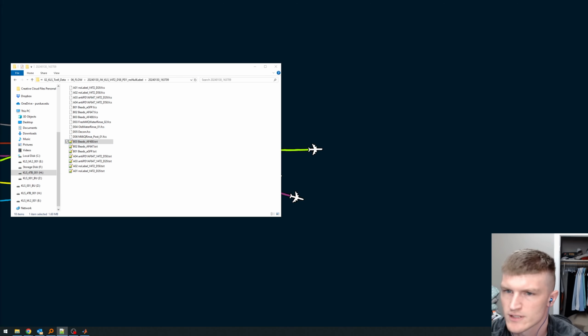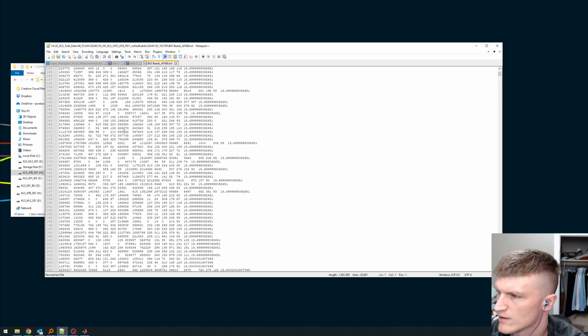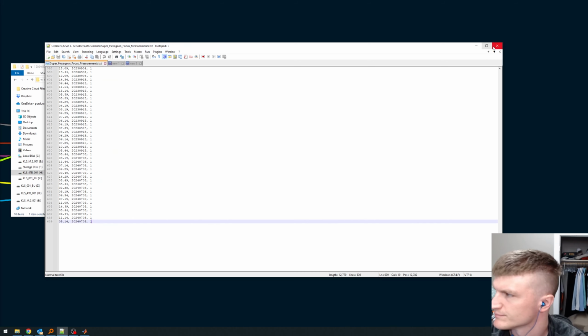Alright, you now have some text files. You can bring those in, take a look at them. You're going to see that they have a bunch of columns, and these have numbers that have not been cropped in any particular fashion, which is fabulous.